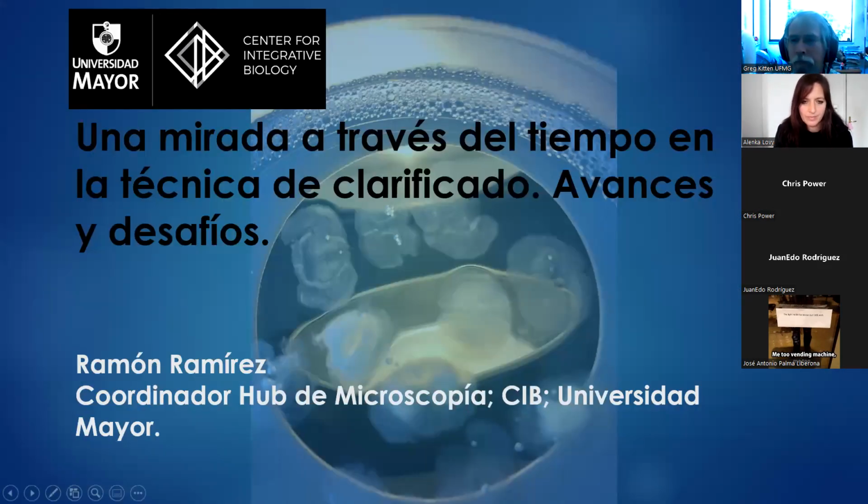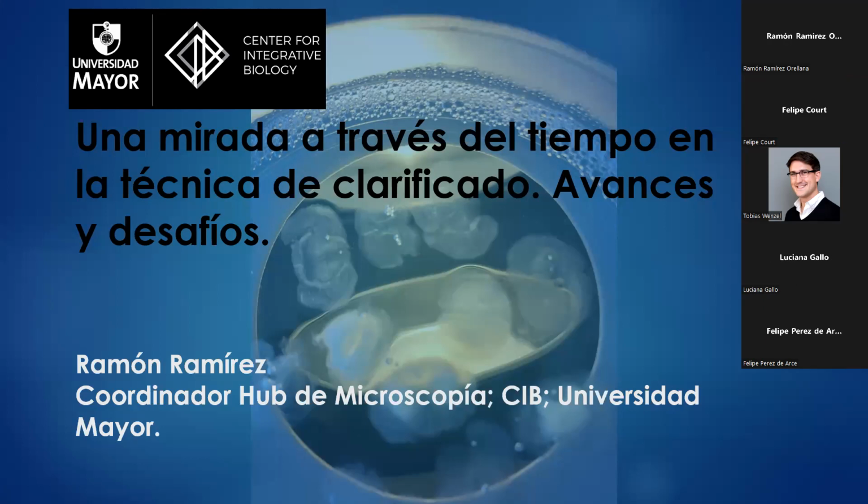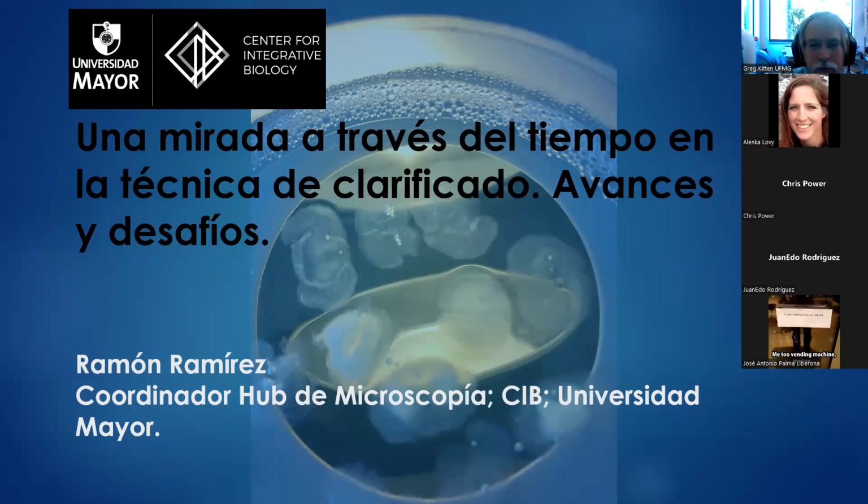Bueno, yo les voy a hablar un poco de la técnica de Clarity y la experiencia que hemos tenido con ella. Desde que nos ganamos el microscopio comenzamos con esta técnica, ya que sabemos que es imprescindible para poder visualizar muestras en el microscopio Lightsheet. La charla se llama Una mirada a través del tiempo en la técnica de clarificado, y quiero que podamos compartir al final con la gente que haya hecho esta técnica algunos tips para poder ir avanzando con esto, ¿ya?